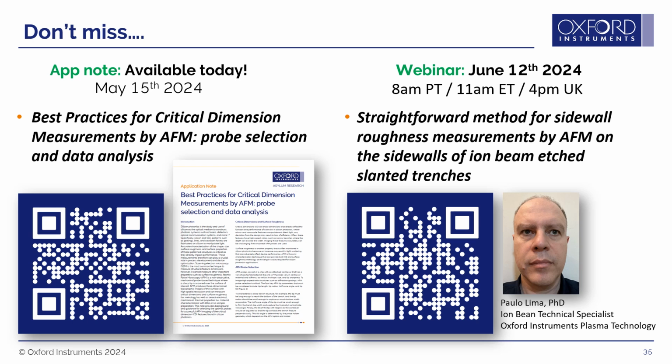Absolutely. So, okay, great. So are there other AFM modes that would be useful to characterize critical dimension features, electrical, nanomechanics, or any other technique that AFM can provide?